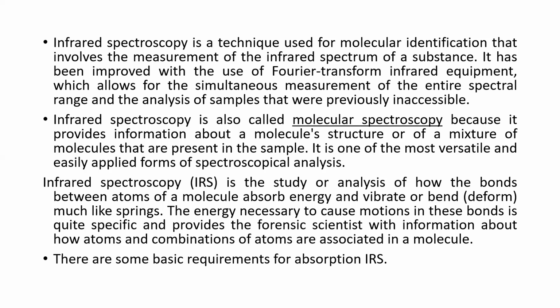So, because we are talking with reference to molecules, infrared spectroscopy is also referred to as molecular spectroscopy because we are determining information about molecular structure or mixture of molecules, or what kind of functional groups are attached to it. So, infrared is going to give us insights about the structure of the molecule, the functional groups present, and how it varies when you compare two different molecules.